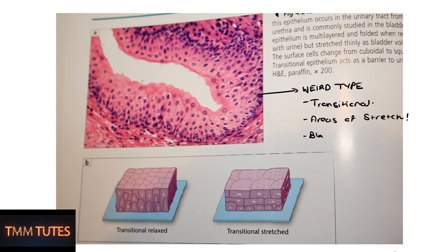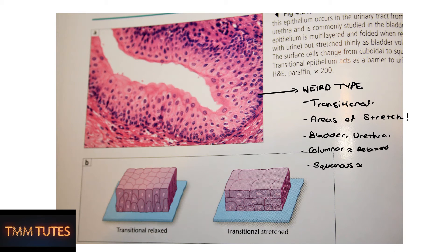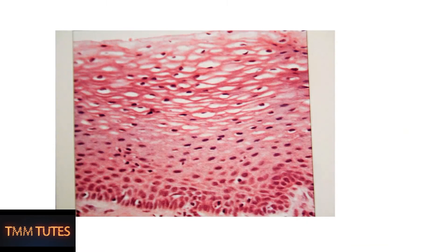This is transitional epithelium — a somewhat unusual type. There are many cells stacked all over the place, and it's usually only found in areas of stretch, like the bladder and urethra. When relaxed it's a more columnar stack, and when stretched it becomes squamous.